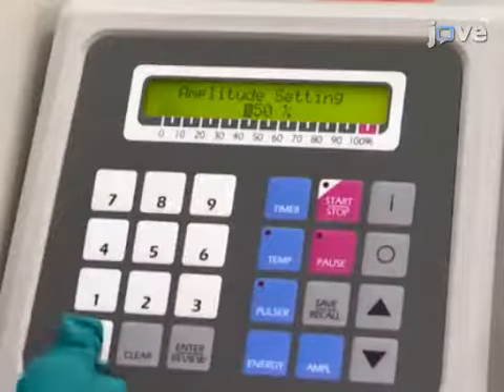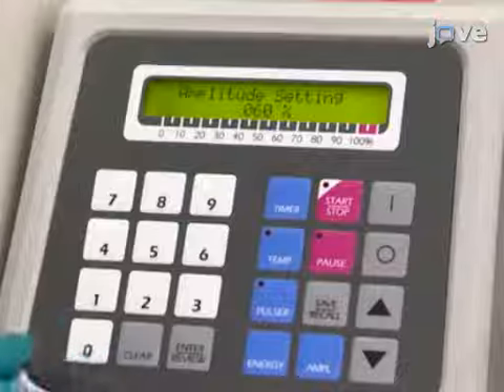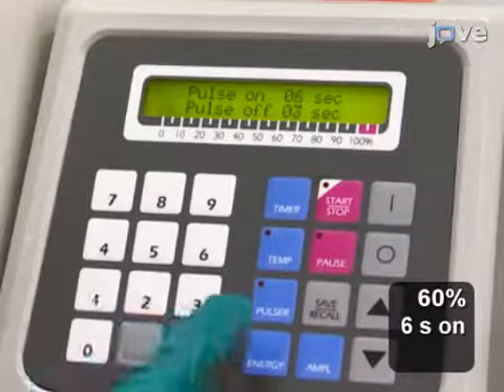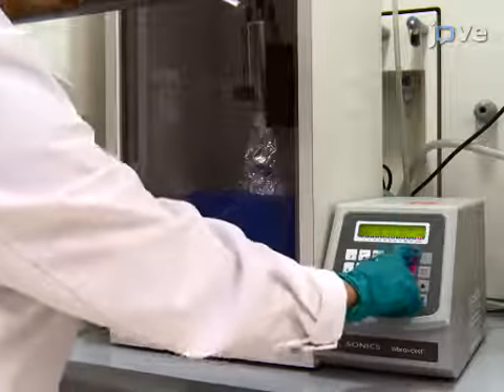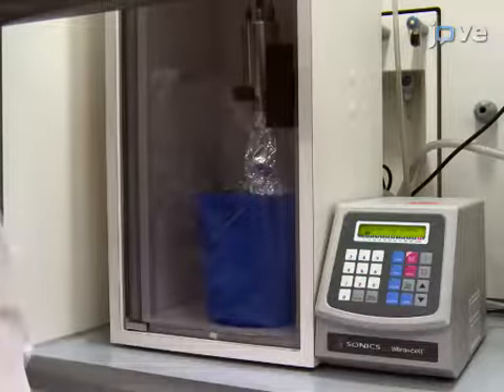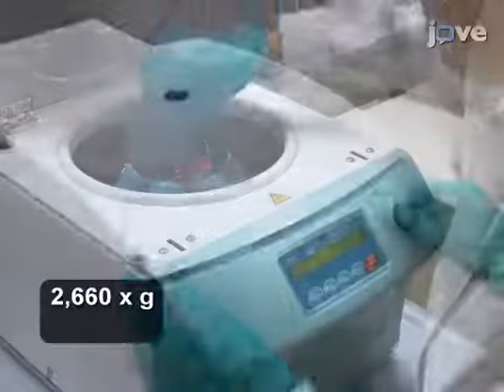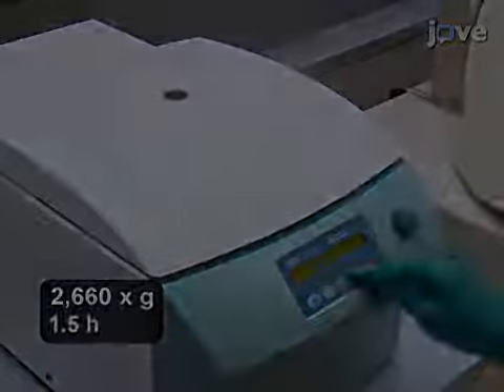To sonicate the mixture by probe sonication, set the amplitude to 60% and the pulsing to 6 seconds on and 2 seconds off. Then switch on the sonicator and run the process for 1 hour. Next, centrifuge the dispersion at 2,660 times g for 1.5 hours.